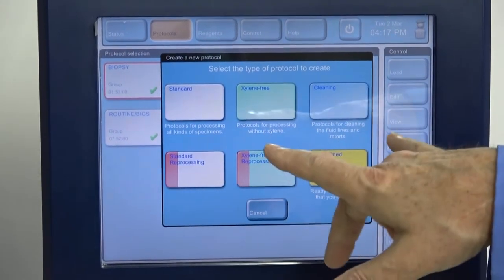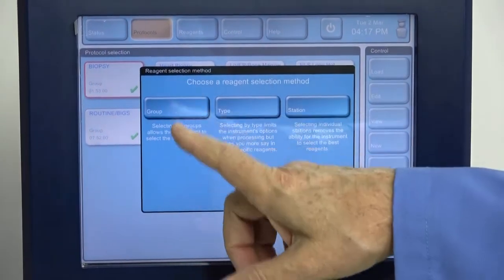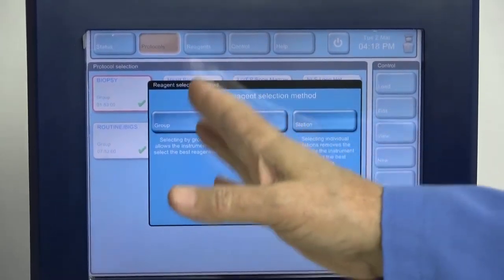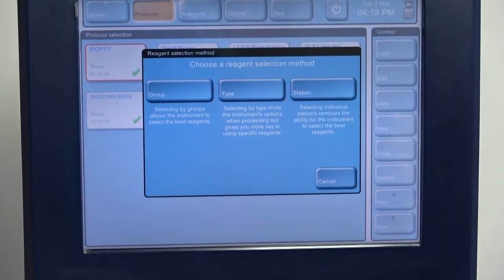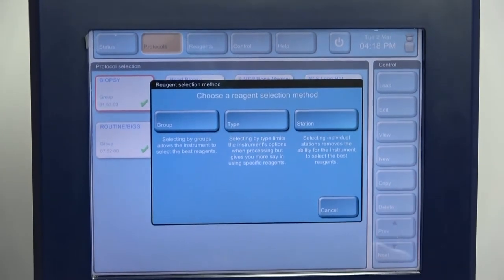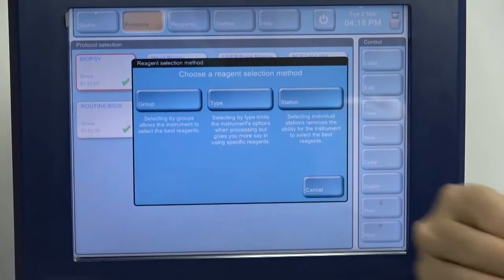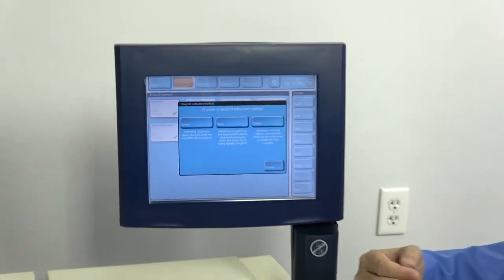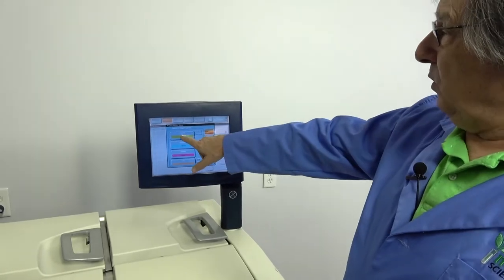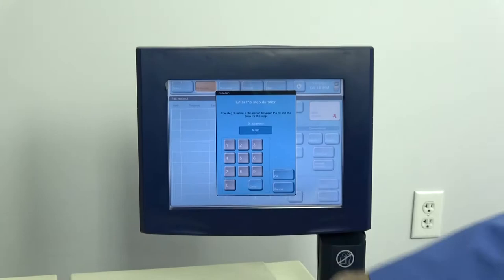It gives you some options on that. We're going to start with a standard one. It tells you that you can do it by group, type, or station. What that means is you can do it by group, so that your reagents are defined as fixatives, dehydrants, xylene or dewaxers, and wax. What that means is it's free to choose which one of the vessels it chooses from. But let's just put group. We can tell we want to do formalin. We want it to be in there for, let's say, 5 minutes.